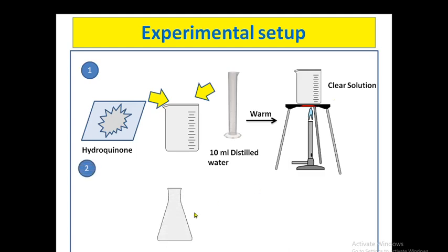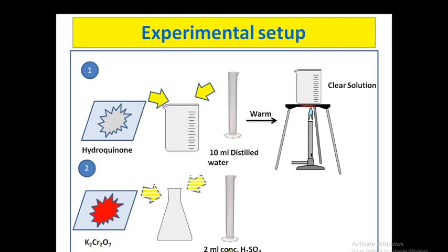Now take a big conical flask and add potassium dichromate and 2 ml of concentrated H2SO4. This solution you have to cool in ice and you will get this ice cold solution.